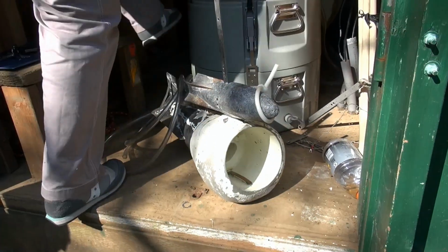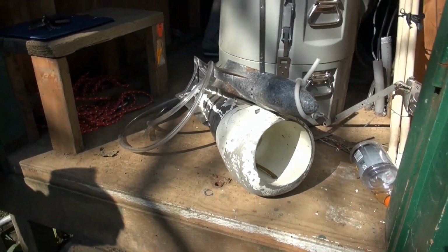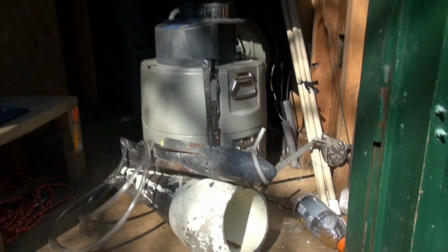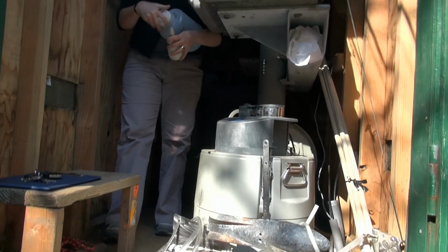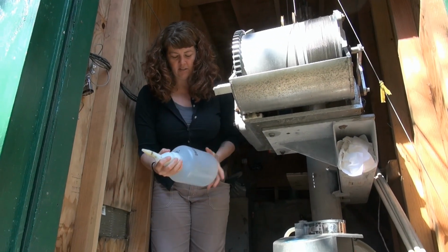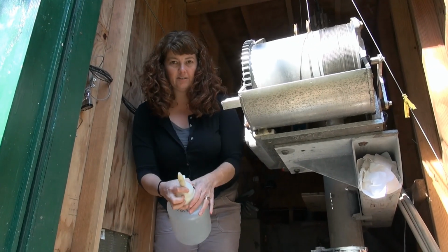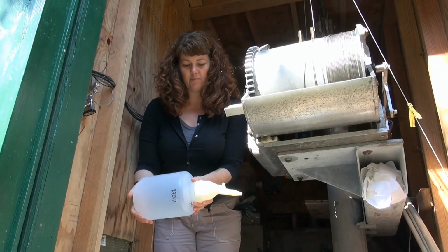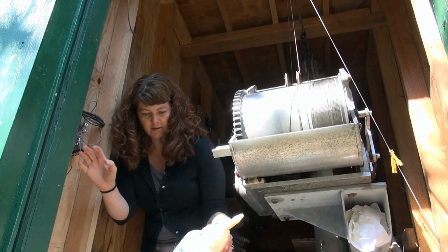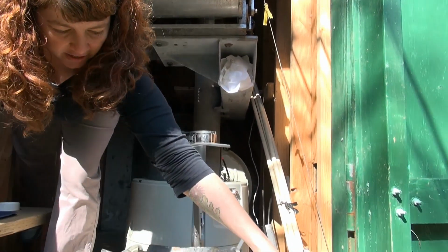Yeah, let me see if I have the full set. So you just do one vertical with that and then bulk it? For this one, we could do more than one vertical. Okay, so this works with the nozzle like this. Until you get into really high flows, you could pretty much do our whole sample and collect it in one bottle. So you're just watching, it's not full, obviously. Yeah, so you kind of have to know.